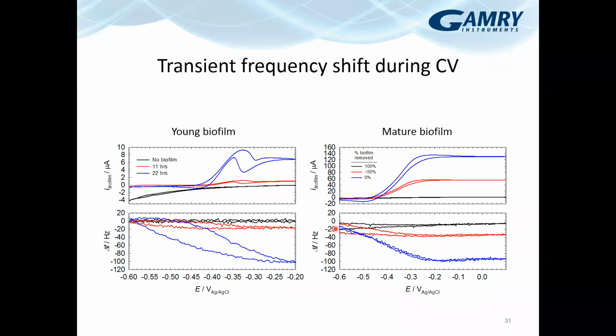But essentially, when the biofilm is in a reduced, inactive state, it tends to collapse on itself. Collapse is a very general word, saying that the void spaces in the biofilm collapse, and so it becomes more rigid. Once you drive current flow, which means going from the left side of this graph to the right side, you oxidize parts of the biofilm and force current to flow.